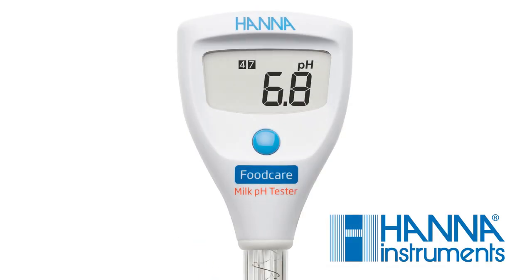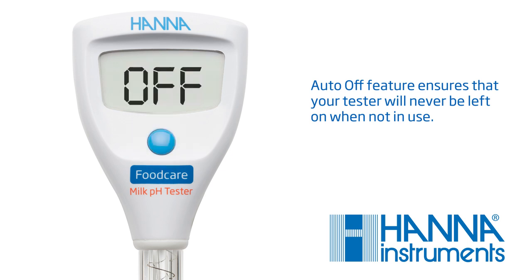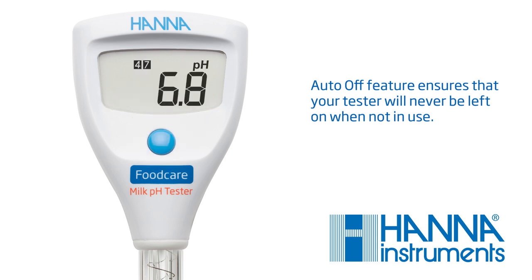Your tester comes with a selectable auto-off feature, preserving battery life and giving you peace of mind in case the tester is accidentally left on. To select your preferred setting, press and hold the button for 6 seconds. Here, you can choose a shut-off time of 8 minutes, 60 minutes, or disable the feature. When finished, hold the button for 3 seconds to return to measurement mode.